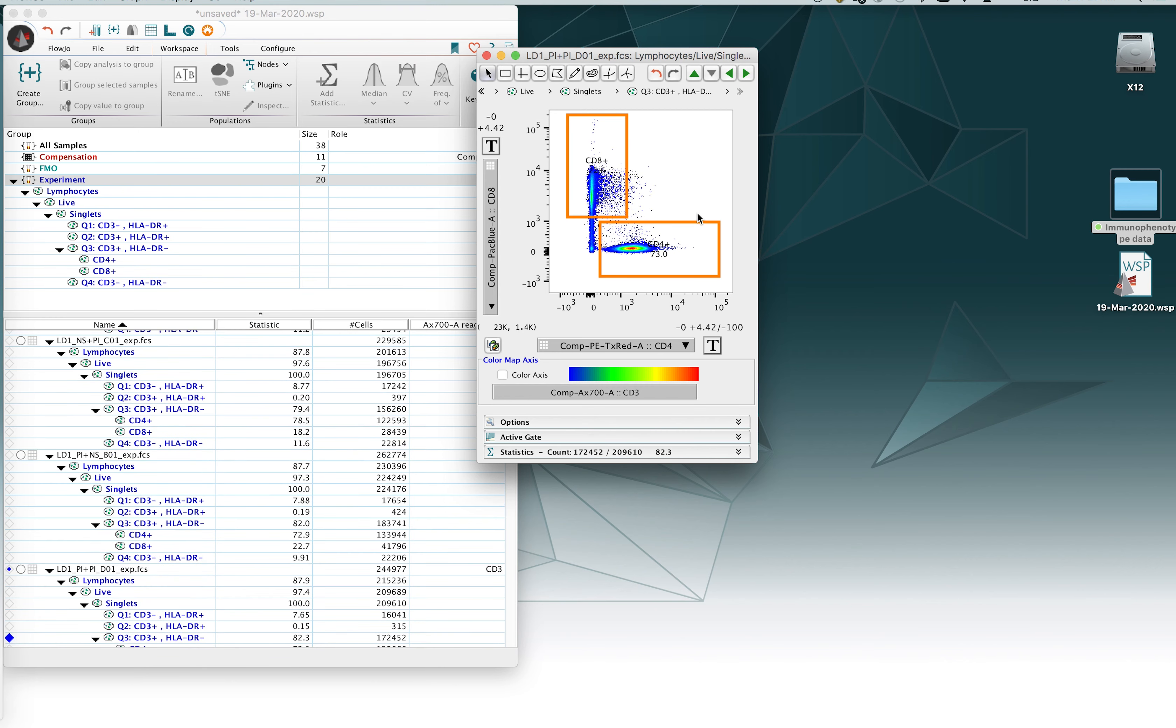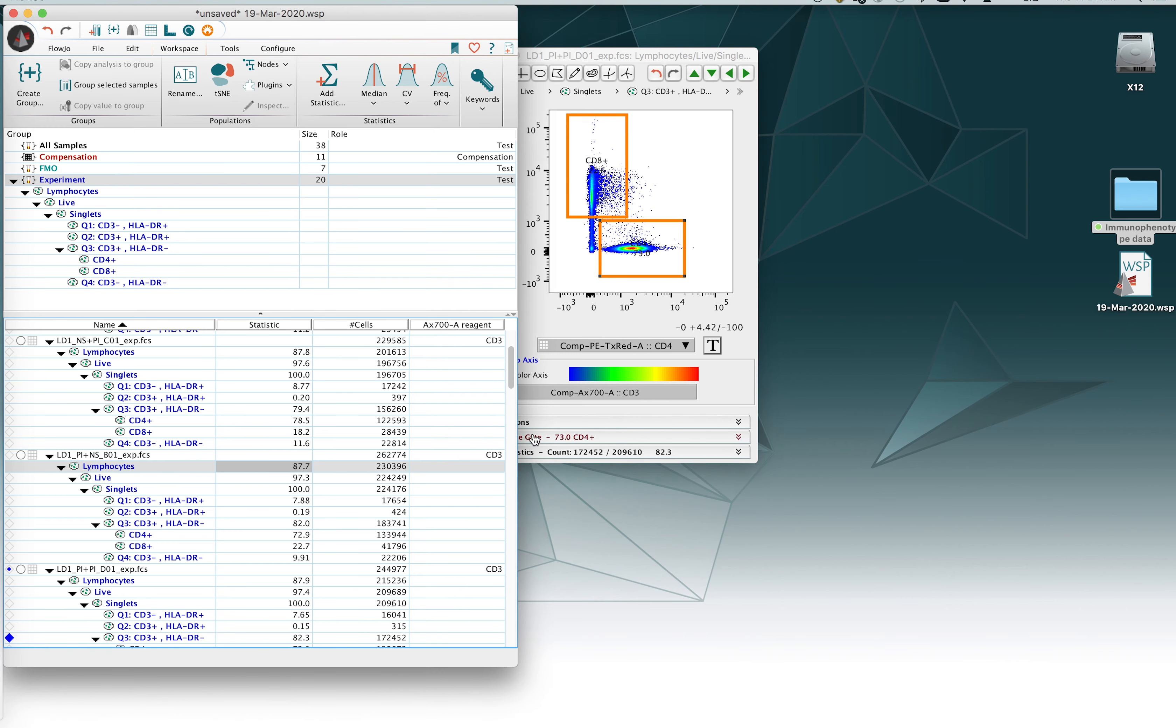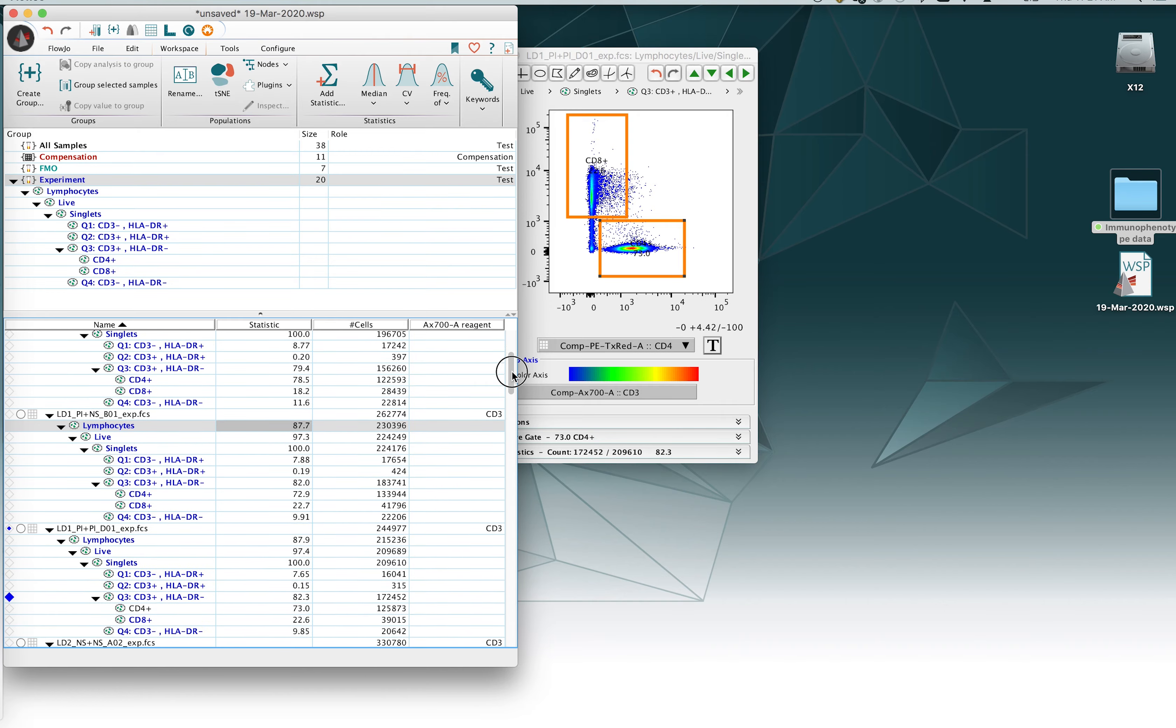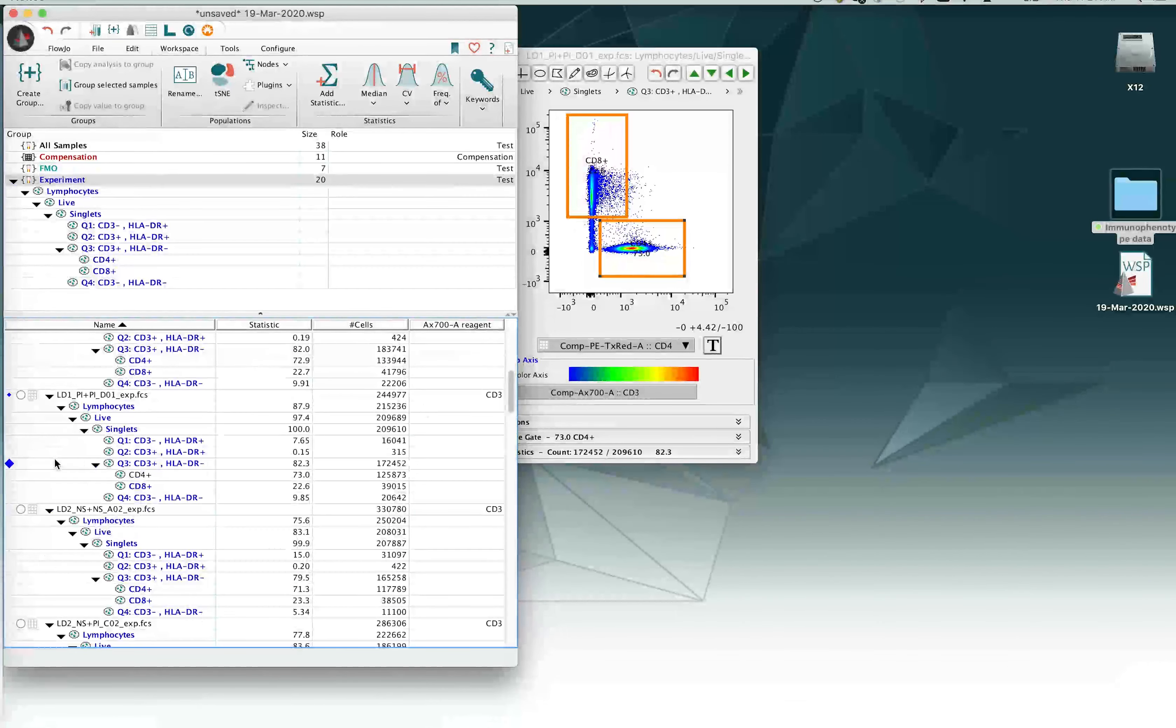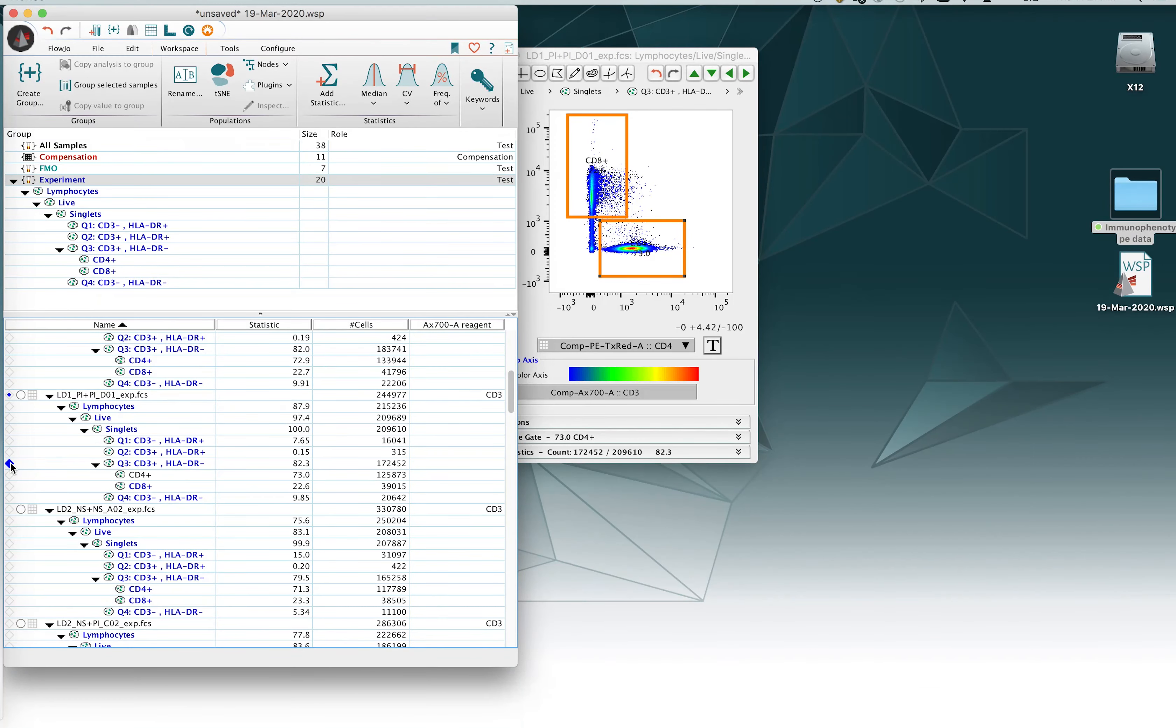Okay, if I go to this sample and I say, okay, you know what, I'm going to go ahead and shrink that back down. It doesn't need to be so long. If I find that particular population, generally indicated by the blue diamond here, you'll notice there again is the CD4 that's kind of in that black, plain black font type.